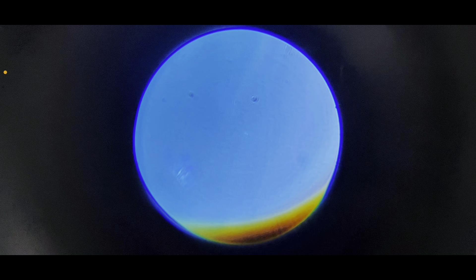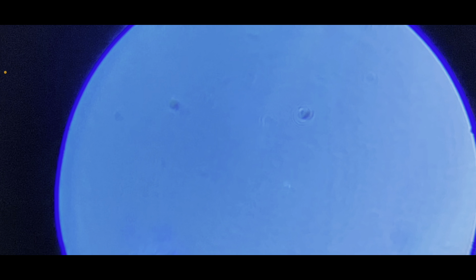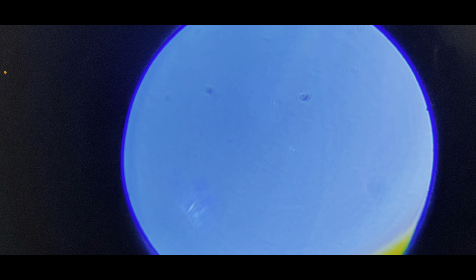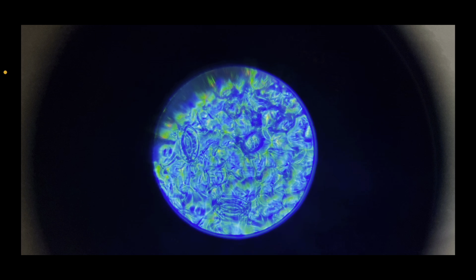I'm not sure if this is what I'm supposed to see, but I only see some nuclei. You can see there are two dark spots — I think these might just be dirt, because if they were truly nuclei you'd probably see a plant cell wall, but this looks nothing like a plant cell. I'm going to switch to higher magnification.